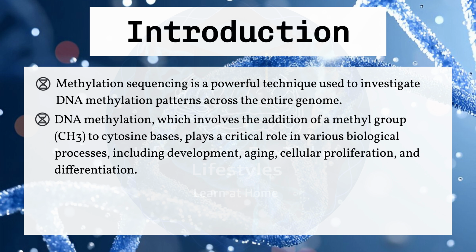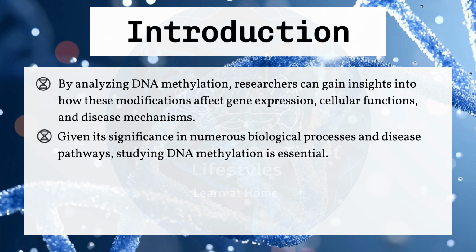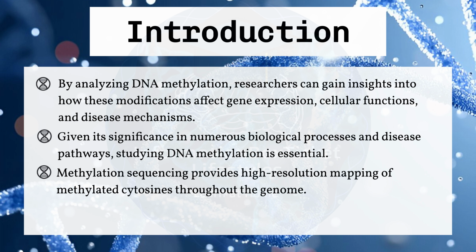By analyzing DNA methylation, researchers can gain insights into how these modifications affect gene expression, cellular functions, and disease mechanisms. Given its significance in numerous biological processes and disease pathways, studying DNA methylation is essential. Methylation sequencing provides high-resolution mapping of methylated cytosines throughout the genome.